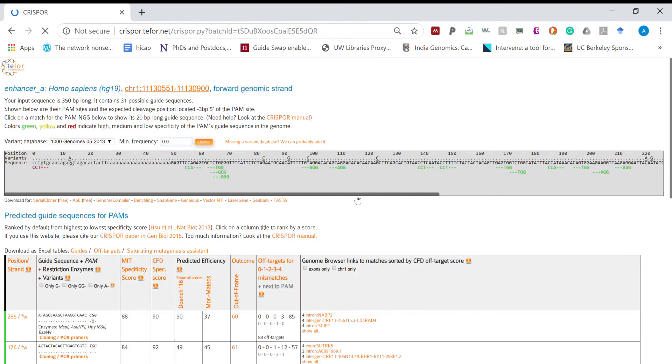In around 10 seconds the page will refresh and predict the possible guides.